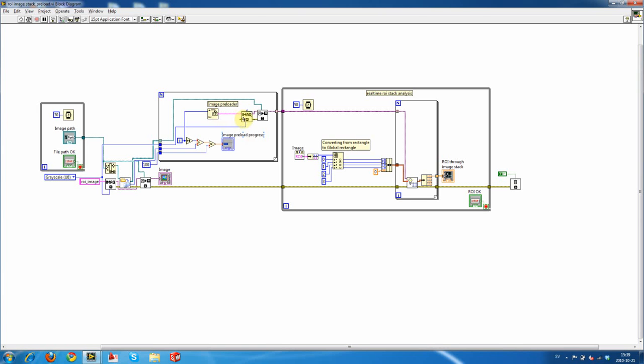How we make sure they're all in different ones is simply done in a for loop: we put the name of the space in the memory equal to the index number, so that we know that none of these images are ever going to be overwritten, because this number is always unique for each loop iteration. And we have a similar progress bar as previously, just using the index number to tell us how preloaded our images are.